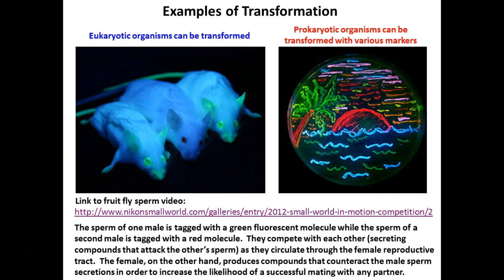We're going to do it in bacteria, and this is in bacteria. So this is bacteria growing on a petri dish, and they just use different ones that are fluorescing different proteins. So green fluorescent protein and red aren't the only ones. There's a whole bunch of other fluorescent proteins out there, and somebody had a lot of fun making this particular one. We've done this with the kids in the past in the summer. We just didn't have as many colors for them to choose from, where they've drawn like I did. But they drew on really huge petri dishes and worked with the art department, so it was kind of fun. So that's for fun. This is real science.